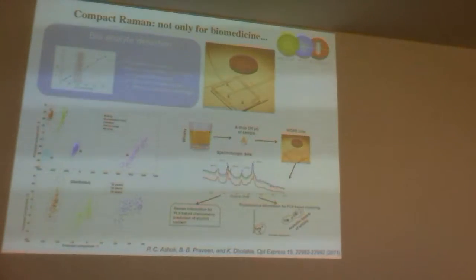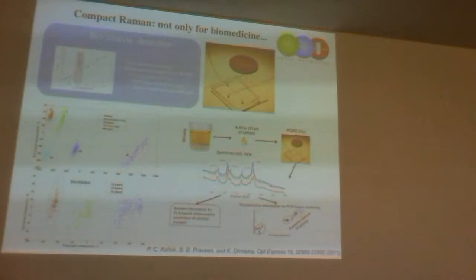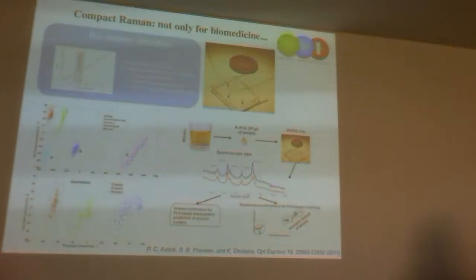As far as I recall, the important parts have to be within about 15 nanometers of the surface for evanescent waves to really interact with them. So that could be an issue.